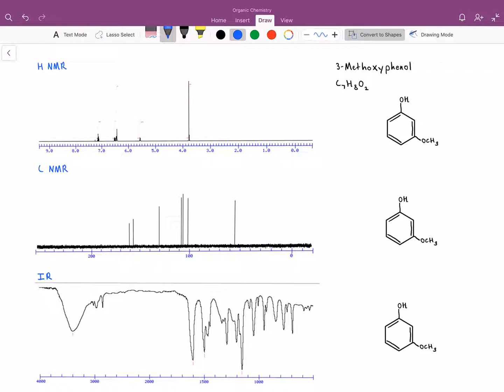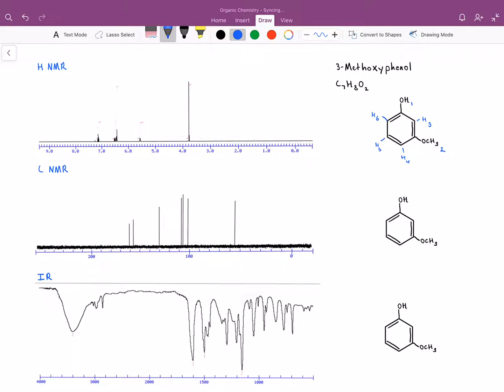I'm going to number them. The one with the alcohol is hydrogen number one. These three hydrogens coming off as a methoxy group from the benzene ring I'm going to number as two — even though there are three hydrogens there. We have a hydrogen here I'll label number three, one for four, five, and that one six. So in total we have eight hydrogens: four on the benzene ring, one coming off the oxygen in the alcohol, and three coming off the carbon in the methoxy group. Over here on the HNMR we have four peaks or four peak clusters.